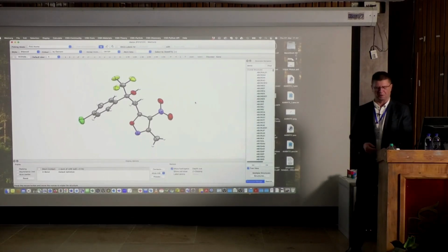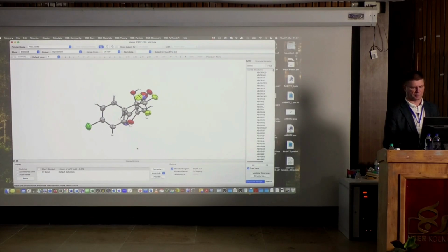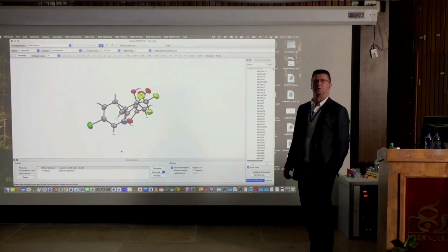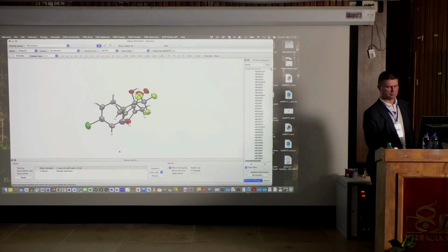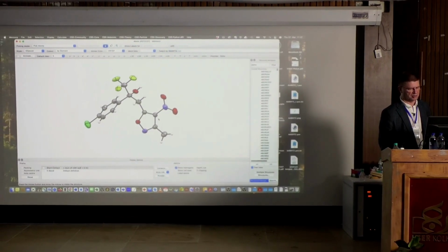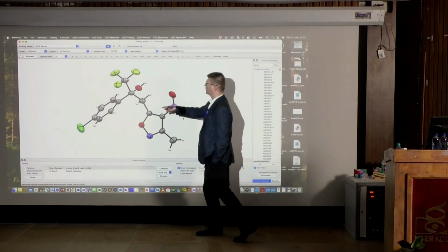But what you have to do often in this case, and this is tricky, what happens quite often, the students, when I ask them to do it, they do it like this. And then they send this to me. Then this is my structure. Yes, of course it is your structure, but I can't see anything, what is there. So always when you're presenting your structure, rotate it in a position where you have a minimum overlap. So then it's very easy for everybody to see each individual atom, like in here.